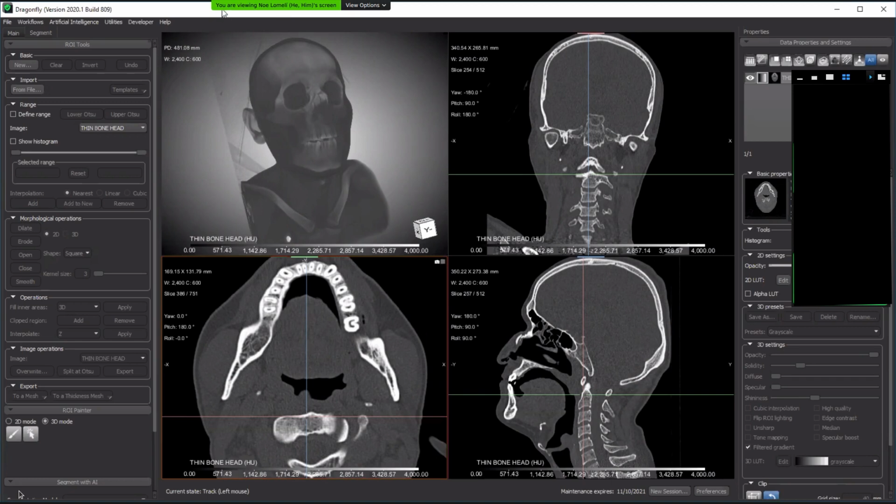It's fine. You don't have to do it now. We can still use yours to try, because your version also already has the segmentation wizard. Some features are not available, but it's okay.